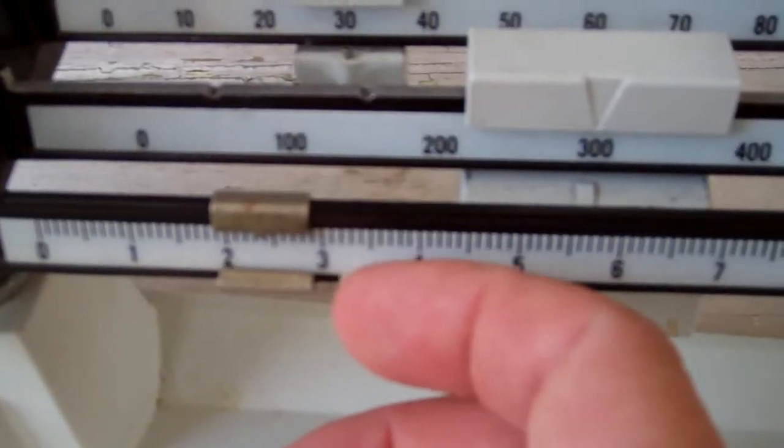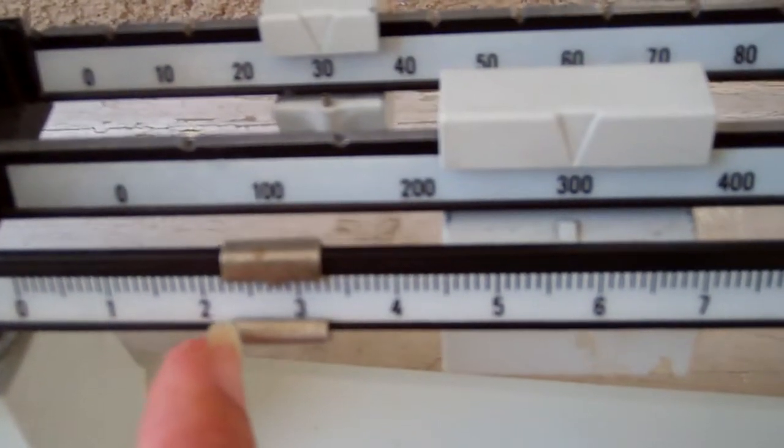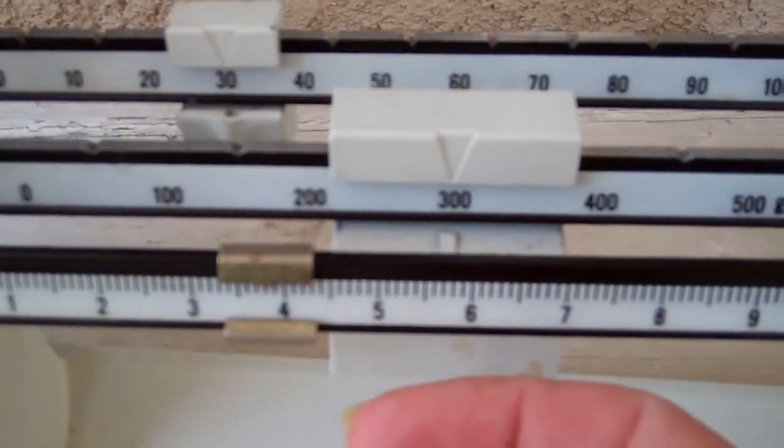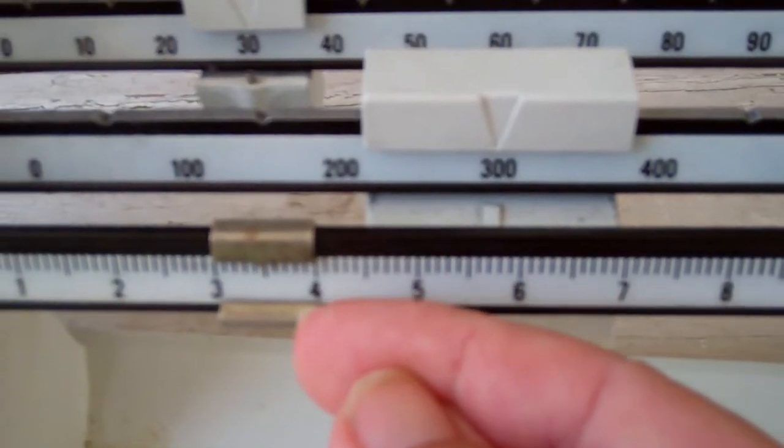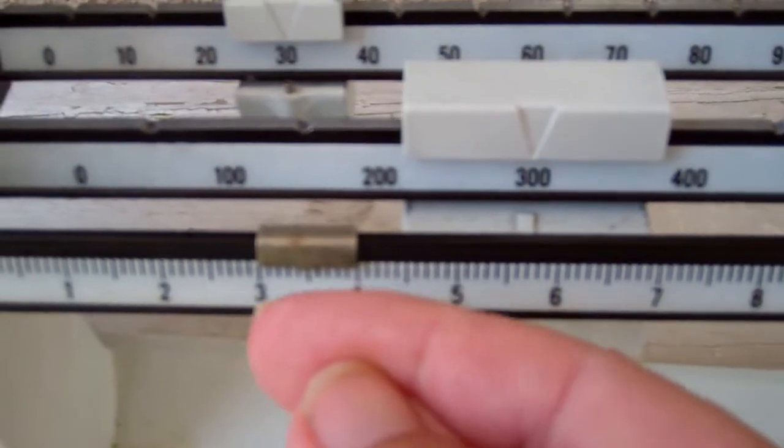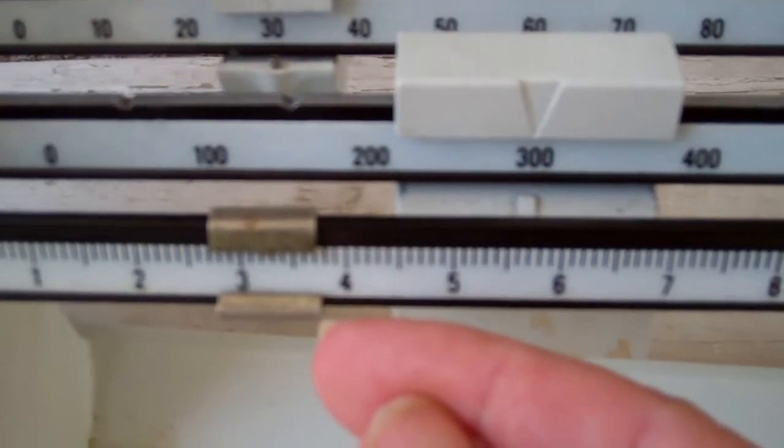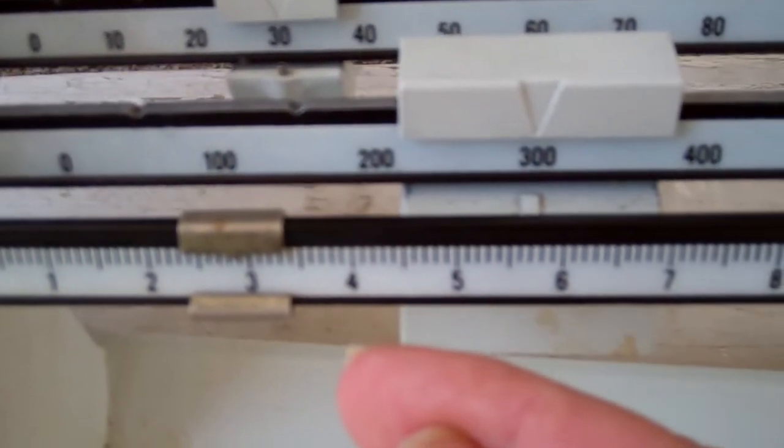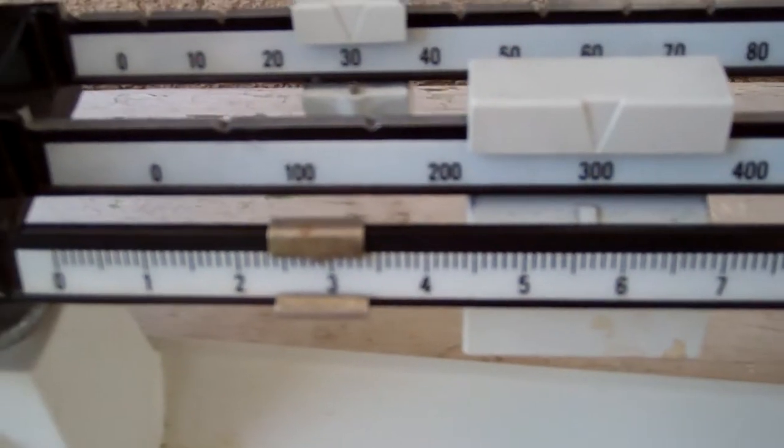Then you have to move these things back and forth until you've narrowed down and gotten those two lines to be zeroed out and match the line up. Now this front rider does not have notches. It rides back and forth on that beam smoothly with no bumps so that you can do these fine adjustments. You're making adjustments that are less than a gram.